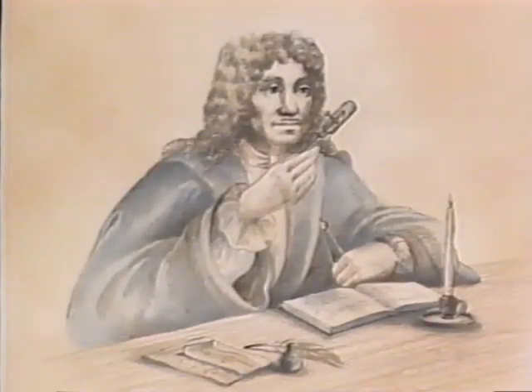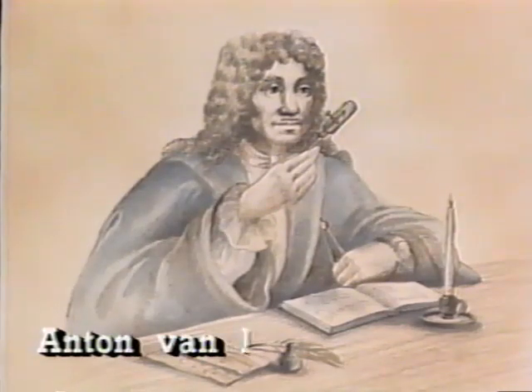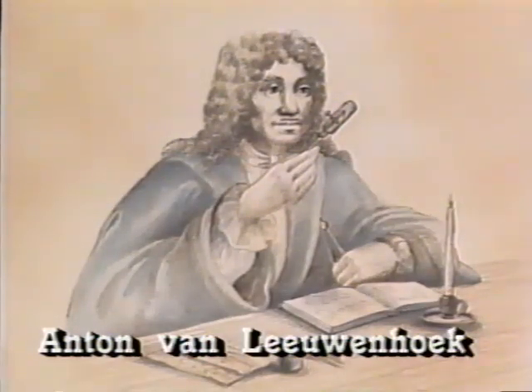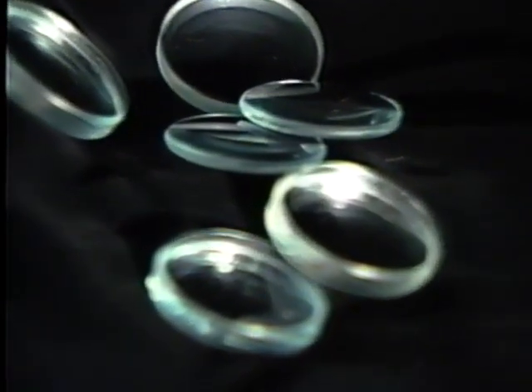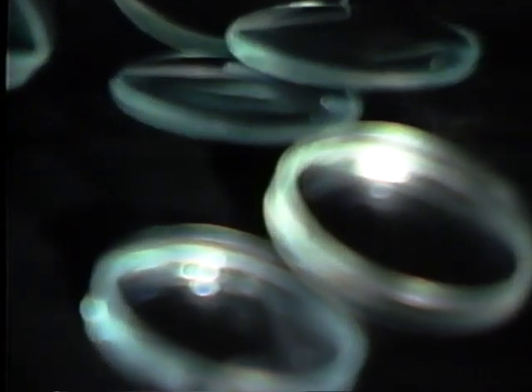To begin with, the man given credit for viewing this invisible world for the first time was not a trained scientist. Anton van Leeuwenhoek was a Dutchman who ran a dry goods store selling cloth. He was the finest lens grinder of his time. During his life, he made 247 microscopes and over 400 lenses. Lens grinding and polishing is very delicate work. The lens must be perfect, or else objects to be viewed will be blurry.